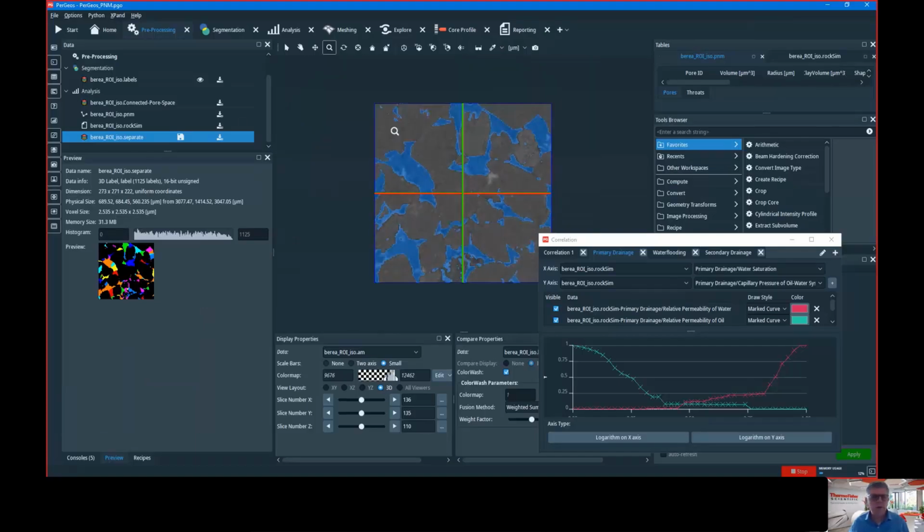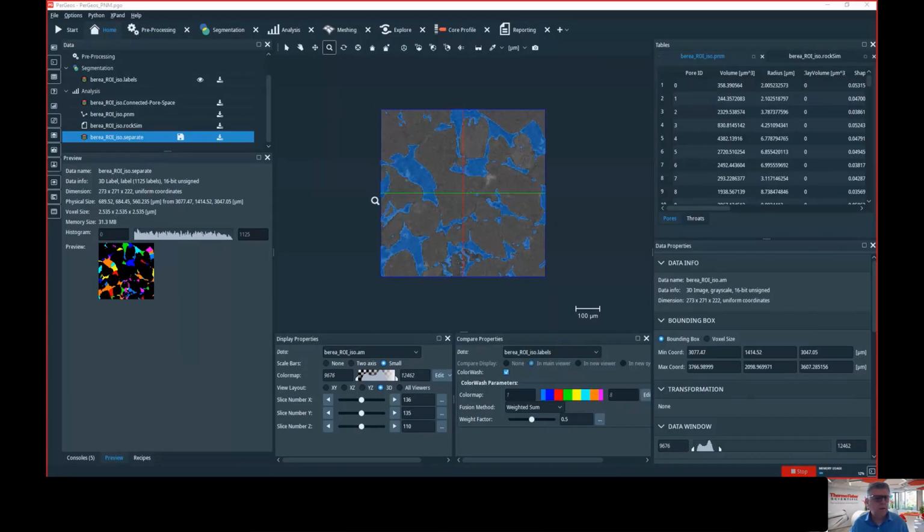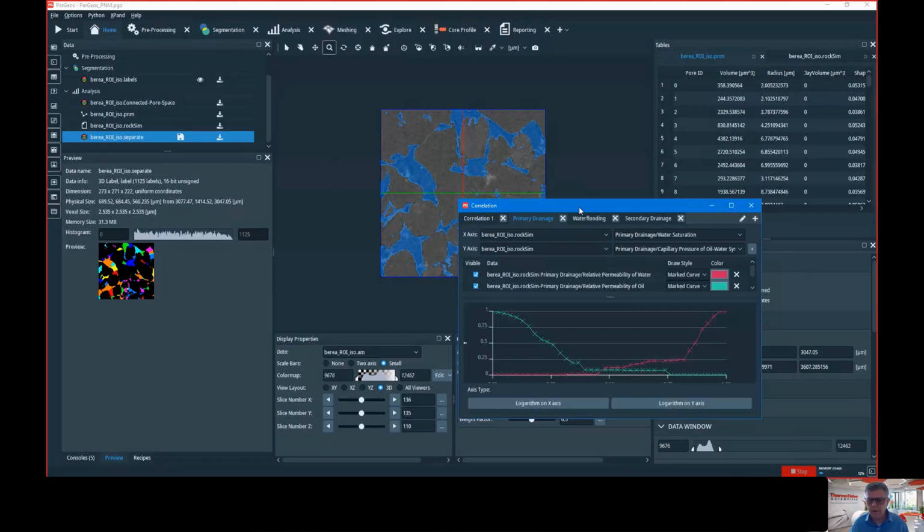Yeah, so this is really PerGeos on my machine. This maybe we show later. So what is this project? It is an example of relative permeability computation done with PerGeos. So you have a similar step at the beginning.